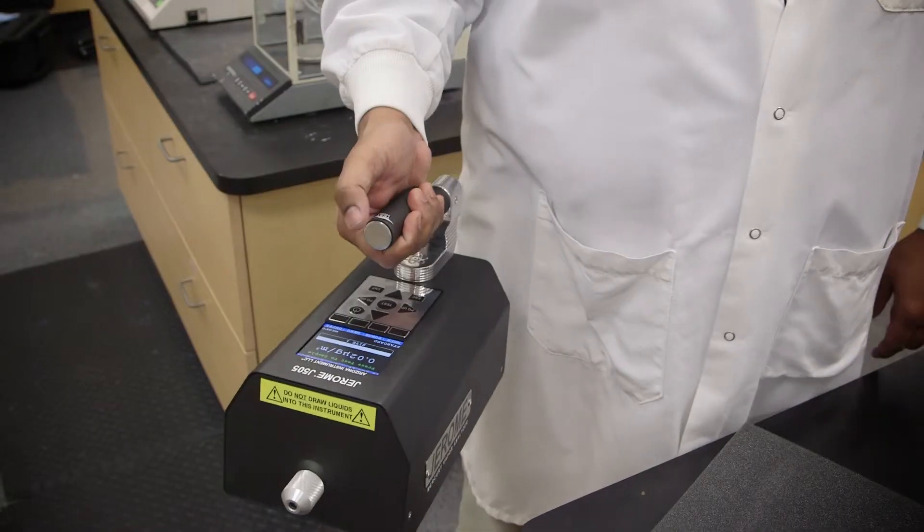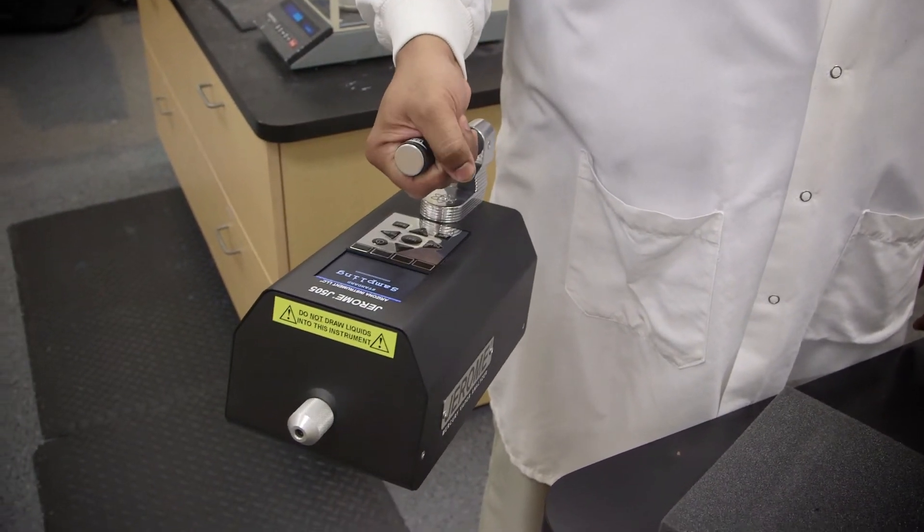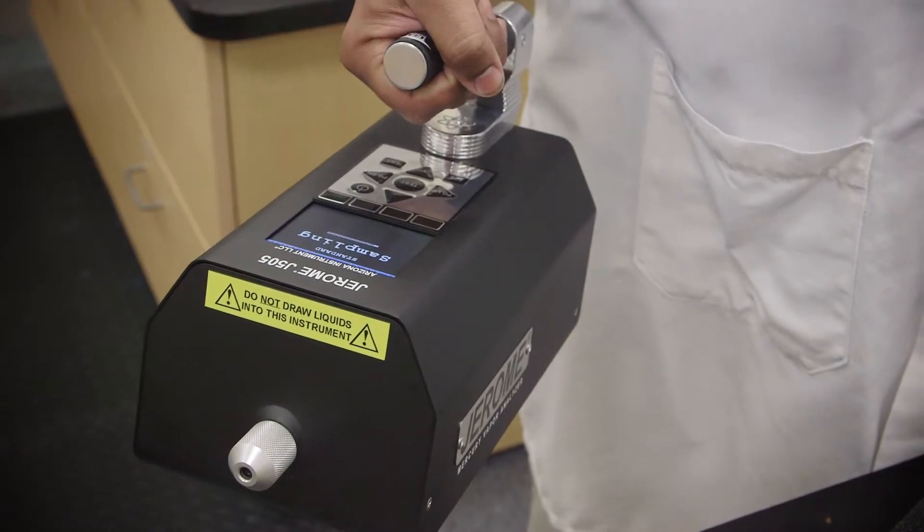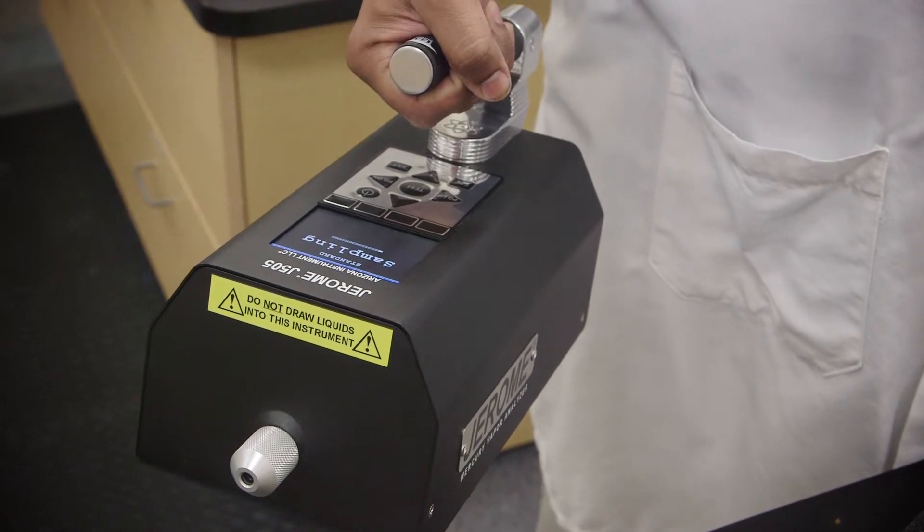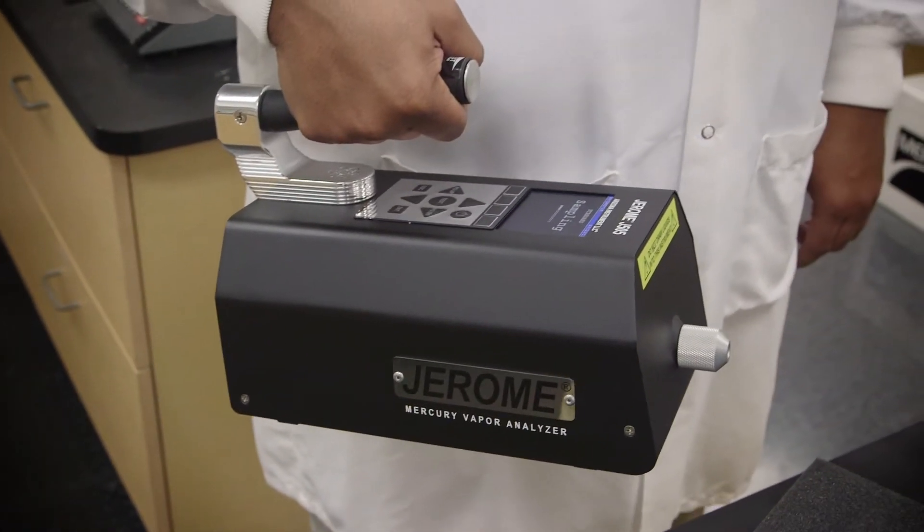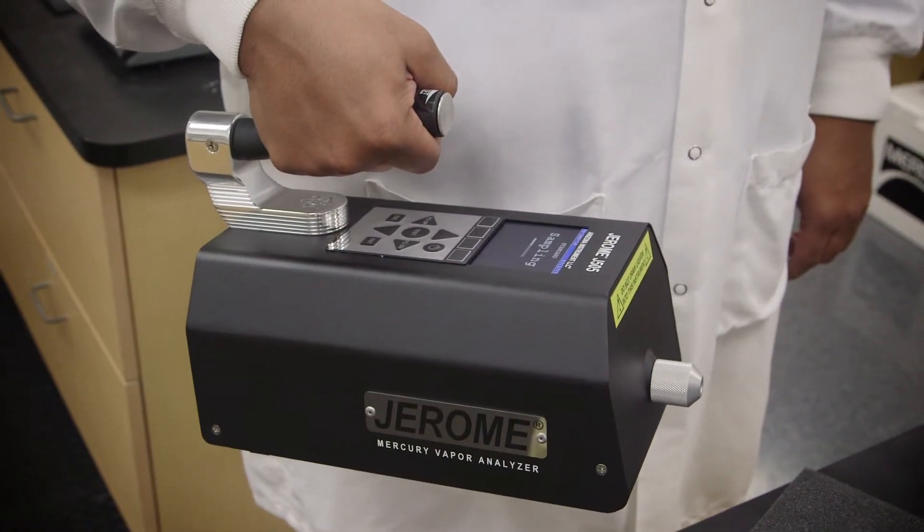The highly efficient optical cell requires less flow to purge the system. This allows the J505 to run at a lower flow rate, minimizing sample dilution seen in competing spectroscopy instruments.